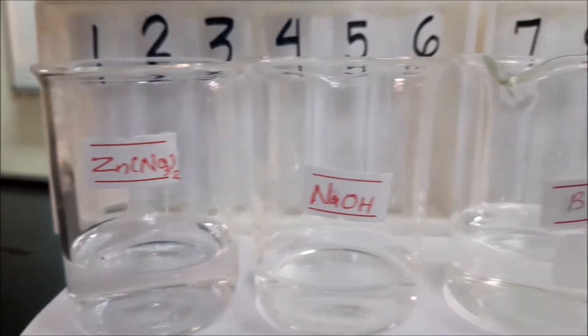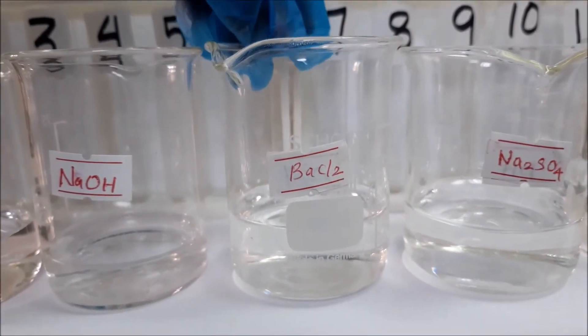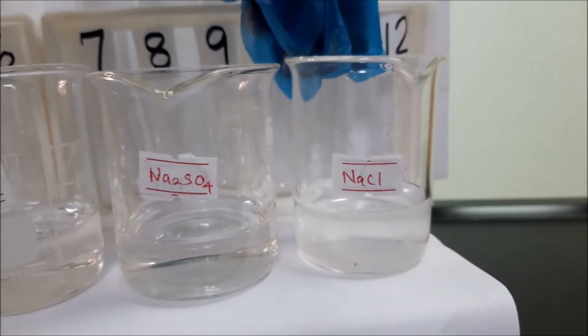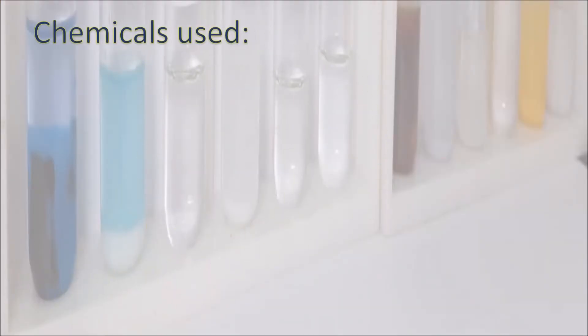We will also need zinc nitrate, sodium hydroxide, barium chloride, sodium sulfate, sodium chloride, and silver nitrate.